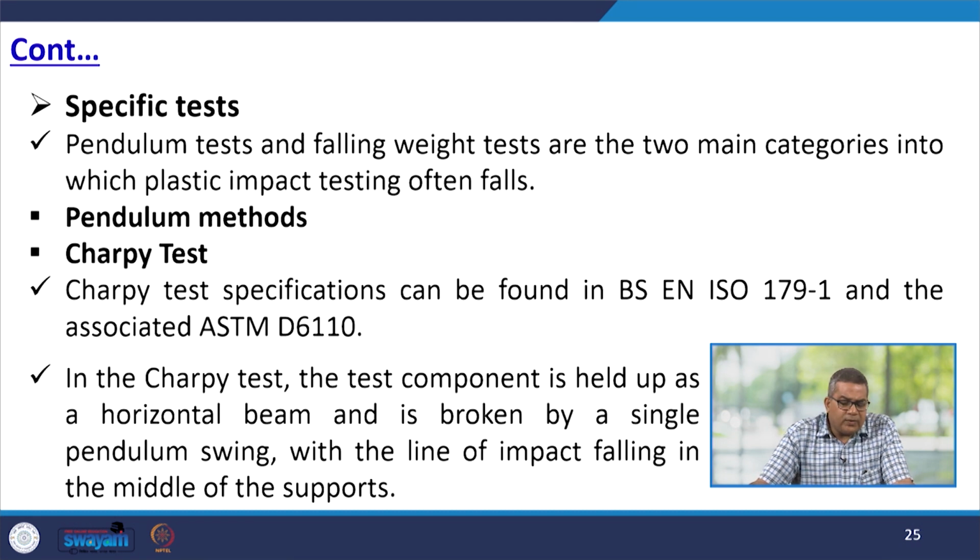There are certain specific tests like the pendulum test and the falling weight test. There are also two main categories into which plastic impact testing often falls. The pendulum methods, one is the Charpy test. The Charpy test specification can be found in BS EN ISO 179-1 and the associated ASTM D6110.